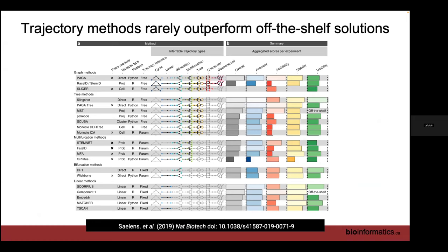Yeah. A lot. You want at least 1,000 cells usually to run one of these reliably. Data points, yeah. Oh, time points? You don't need any time points, but you need to have cells covering multiple different states. So if your cells differentiate very heterogeneously, you can do one time point and have cells at different time points in developmental time, and then you can still align them. But it depends on your system. If that's not the case, you should probably do at least 3 time points, and then you'll have fairly good coverage. And you should see a trajectory in theory.